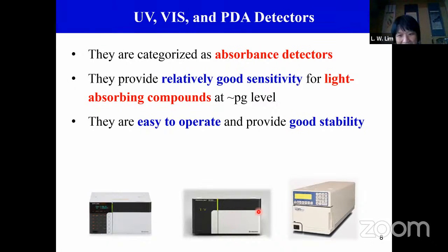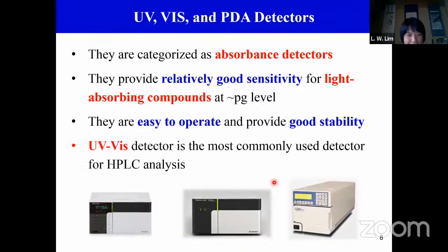So usually, for this Jasco detector, if you look a bit carefully here, there is one small part and then these are the other parts. There are 4 places for the 4 tools, the other detectors or the pump to go on top. Usually the pump, the detector, everything will be similar size, similar design, so you can overlap them and put them together to save some space. So it is easier.